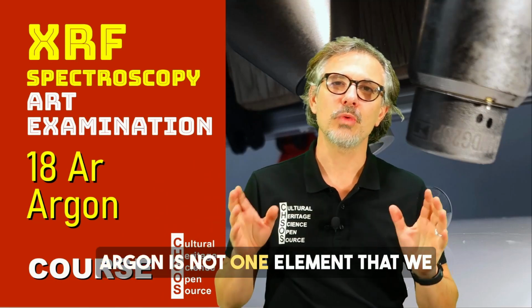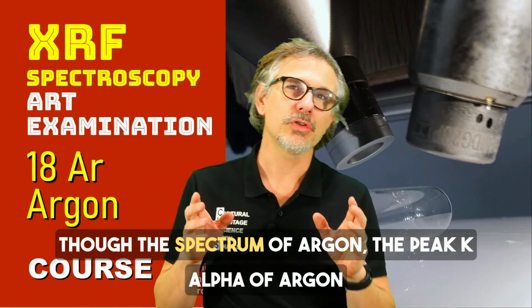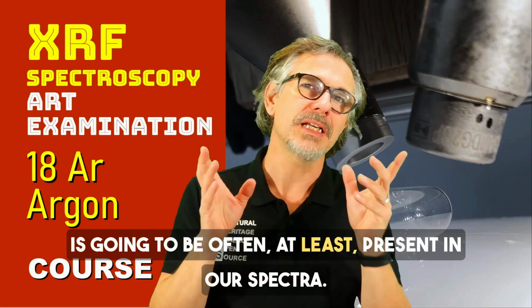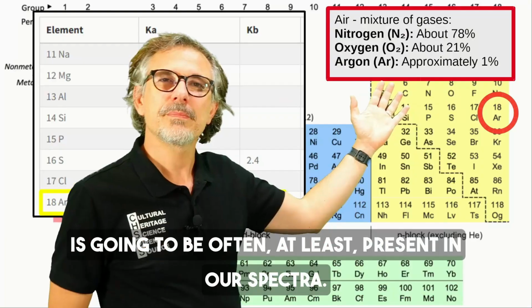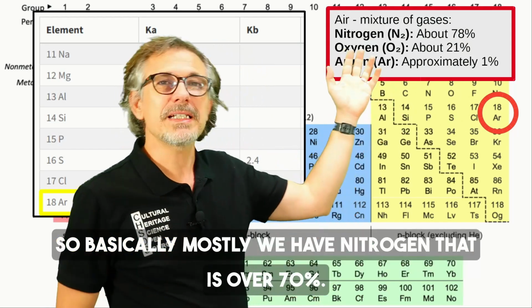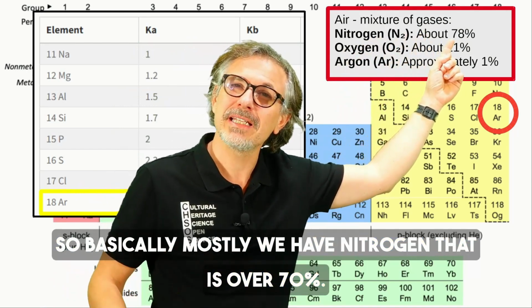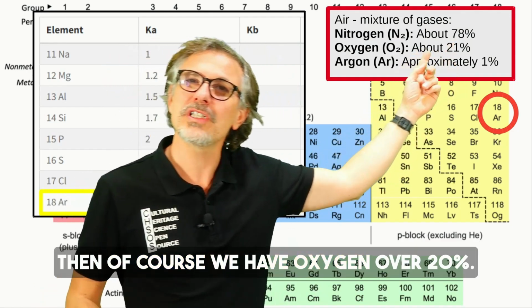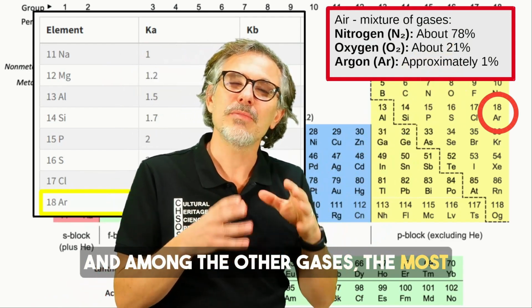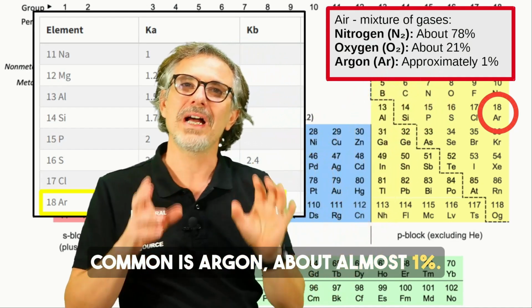Argon is not one element that we are going to find in pigments, though the spectrum of argon, the peak K-alpha of argon, is often at least present in our spectra. This is the reason. Air is a mixture of gas. Mostly we have nitrogen, over 70%, then of course oxygen, over 20%, and among the other gases, the most common is argon, at almost 1%.